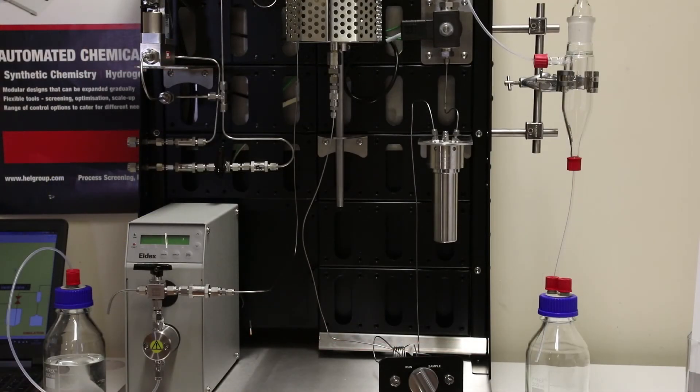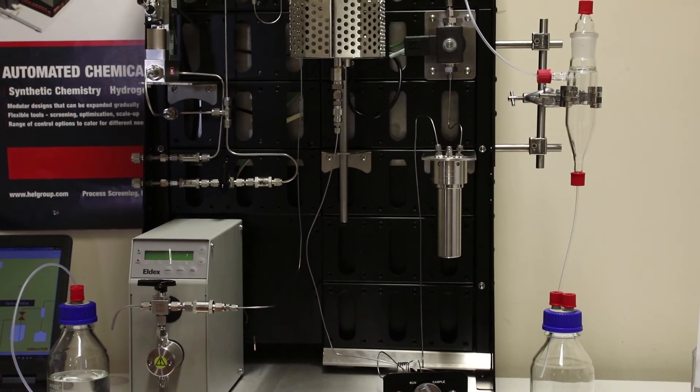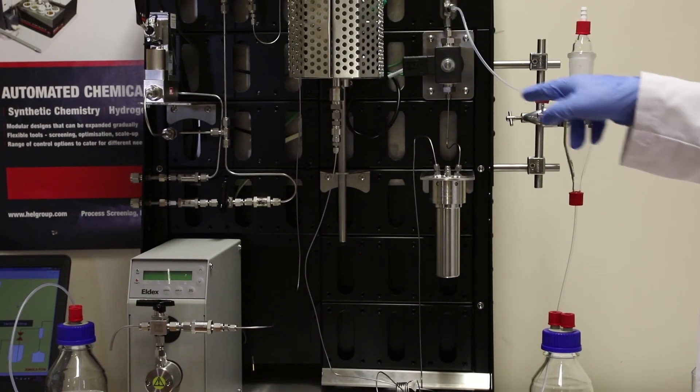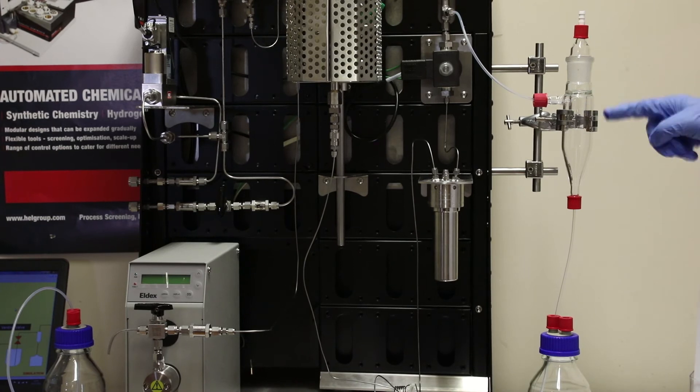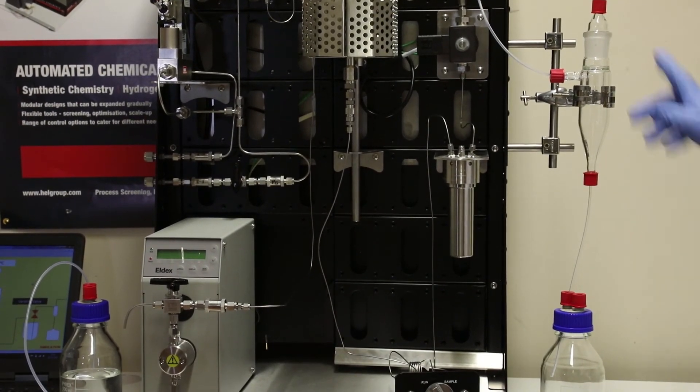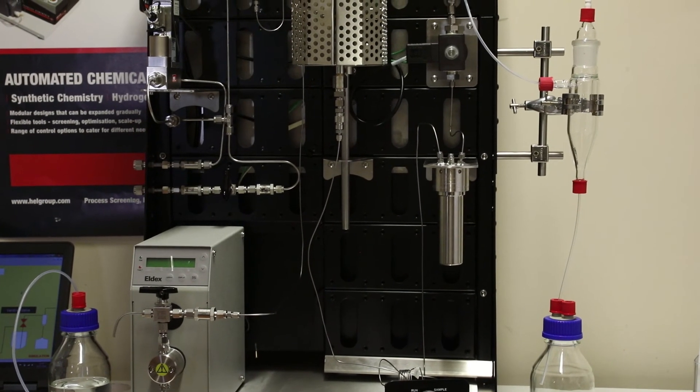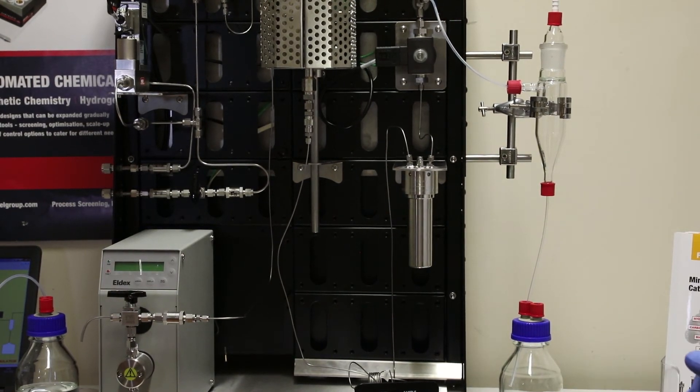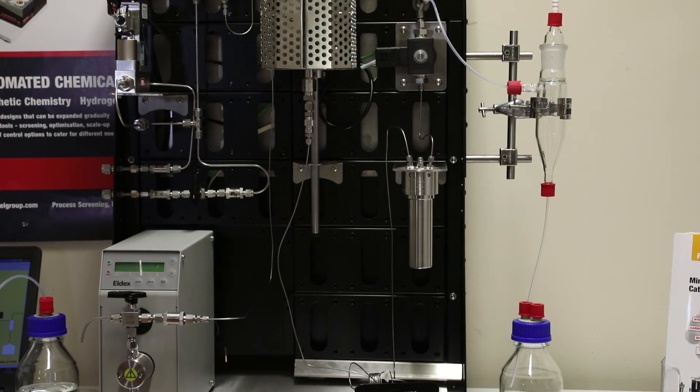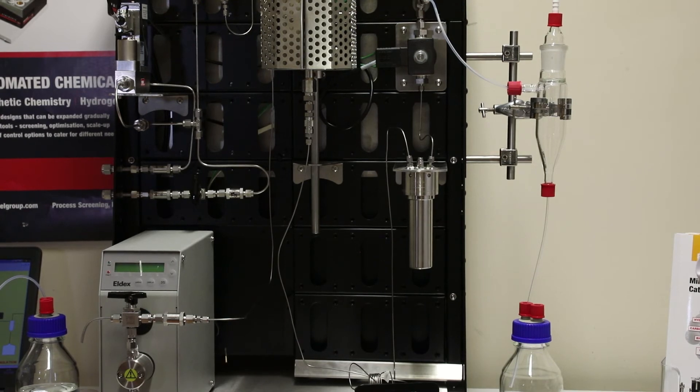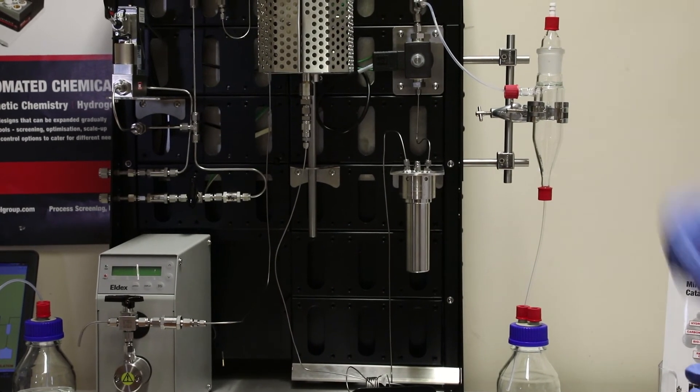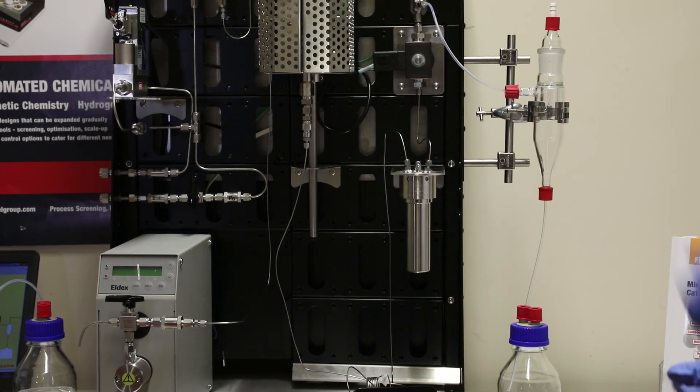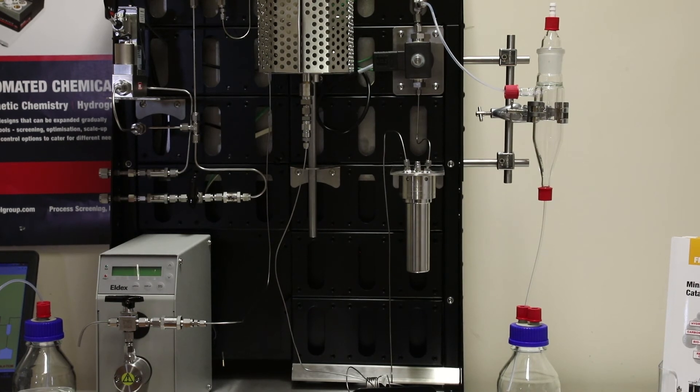After the sampling valve, we have our PAT pressure regulation system. This valve will vent the liquid and gas together, and it will open and close to control the set pressure defined in the software. Liquid and gas flow together out through this tube and into our cyclone separator. Here the liquid will drop out the bottom, and here we're collecting it just in a simple bottle, and the gas will come off at the top. If, for example, you're doing a direct oxidation reaction where you're running O2 through the reactor, which is something you can do on our systems, you might want to purge nitrogen back through just to strip the oxygen out to avoid any flammability risk. If you've got a particularly toxic or flammable gas, then you might want to route this through into a scrubber or a venting system. However, most clients will just vent into a fume hood, and a normal fume hood extraction rate will remove the gas at a sufficiently high rate that you won't get any sort of dangerous buildup.